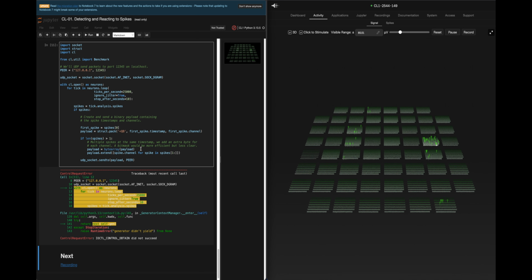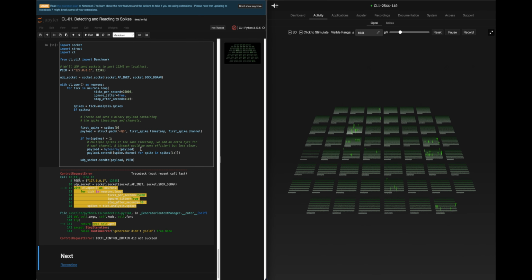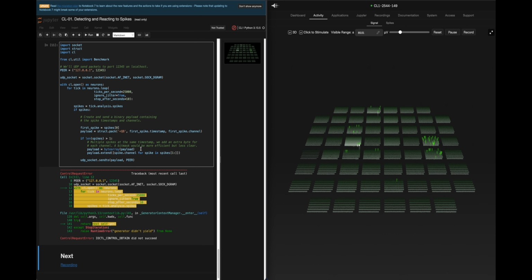But through looking through the documentation and using the tools we have today, like AI agents, I'm able to take this knowledge, pair it with the powerful coding that comes from Claude and ChatGPT, and improve my performance and get what I really want out of the platform. That's what I want to share with everybody. Again, our mission is to bring biological intelligence to 1 million developers. This is how it happens: getting under the hood, taking the extra time, working with the platform, and showing, on real biological intelligence, the benefits and pitfalls of different approaches.